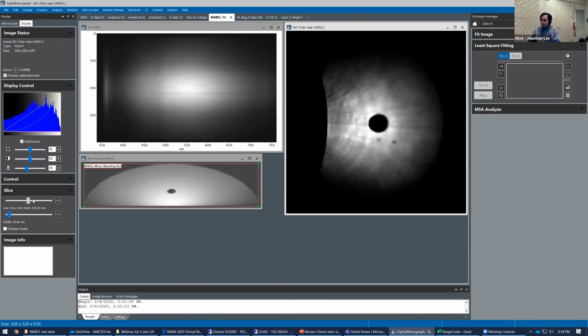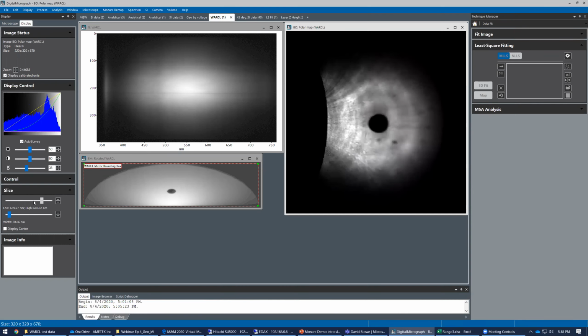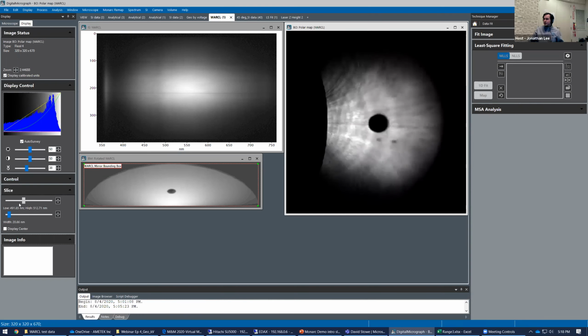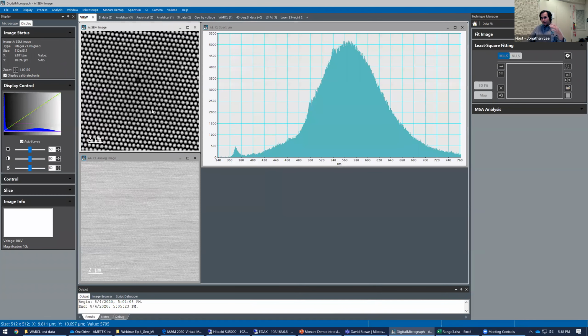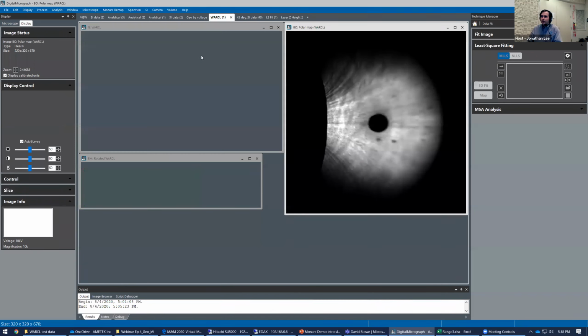Yeah. So you can see a hexagonal sort of shape that's coming out and changing as a function of wavelength. And that hexagonal shape is from what? It's coming from a photonic effect in the sample. That sample was actually designed to have a photonic behavior. There are pillars that are so close together in an HCP arrangement. Okay, great. Thank you.